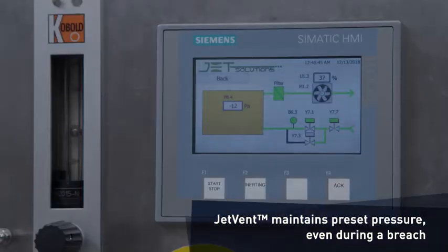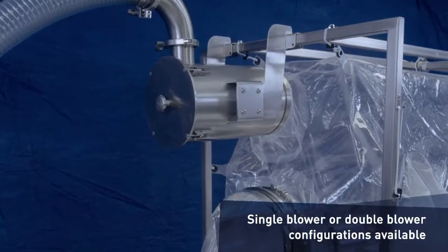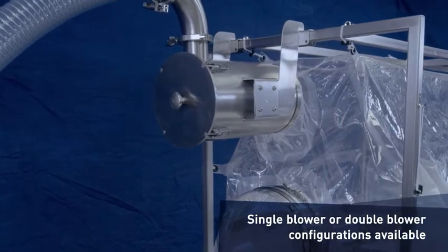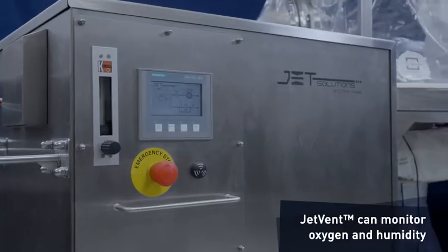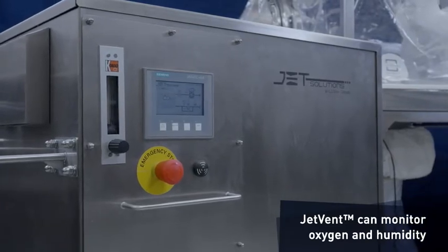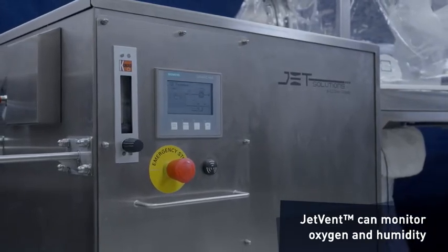Even during a breach condition, the JetVent responds automatically and maintains a negative static pressure. The JetVent can be configured with a single blower when a pressure gas is available or a double blower when it is not. JetVent can also monitor and modify oxygen and relative humidity when provided with suitable supply gas and configured with set points and alarms.